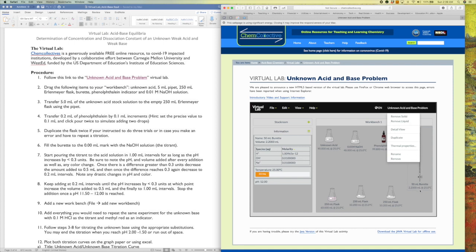And so now you can see there is 2.2 ml of liquid in this burette because it's counting this part of the solution that's under the graduated part. But if you remove the liquid, now you're at 0.